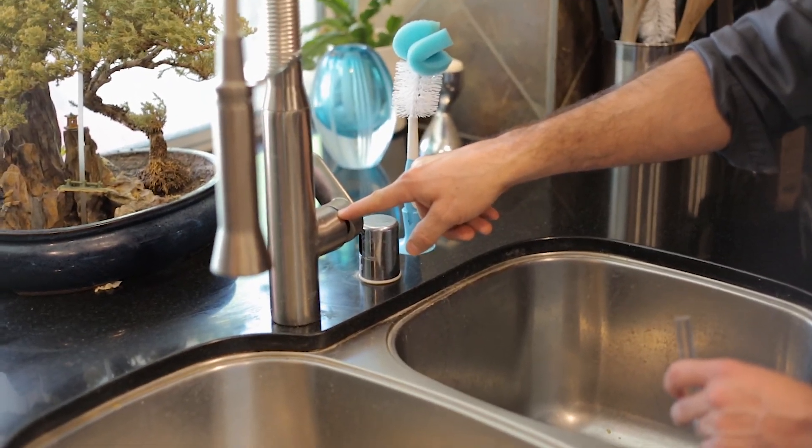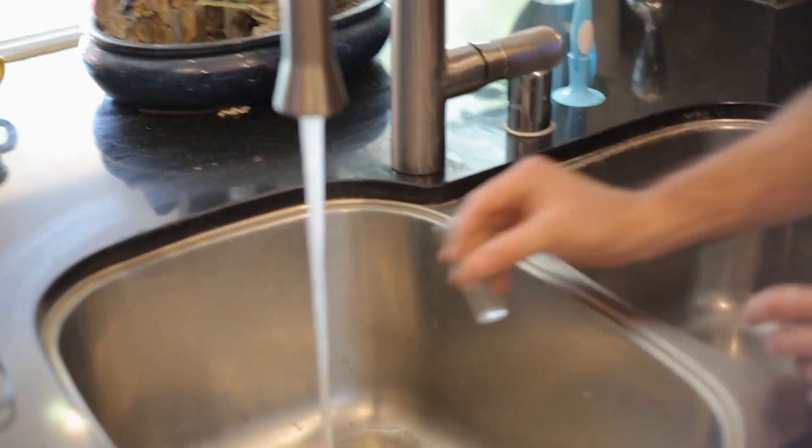On the faucet, we're going to make sure that we test on the hot water side only. So we're going to take the hot water and fill up our vial.